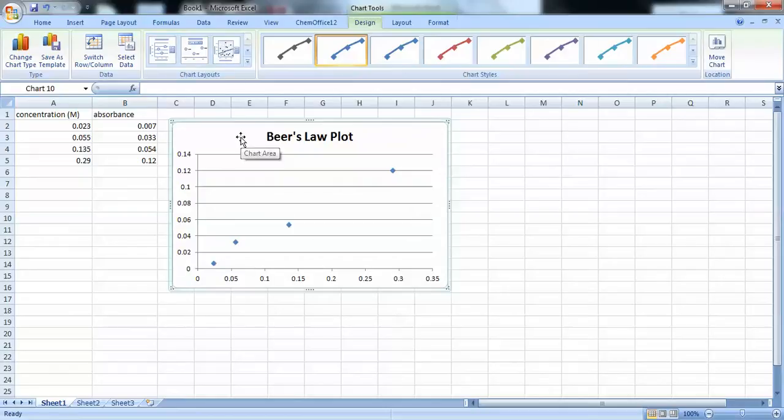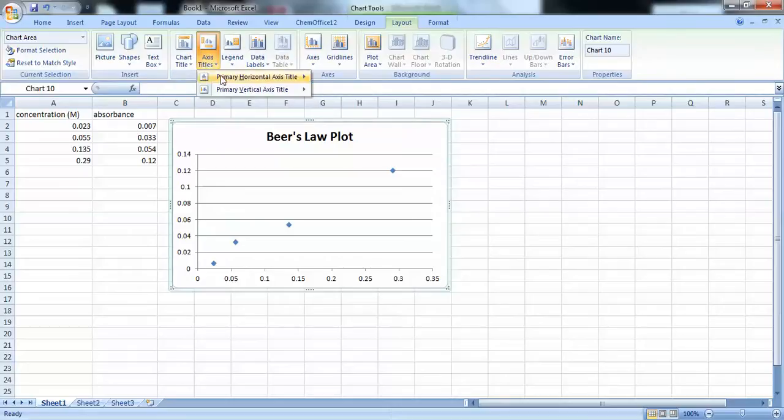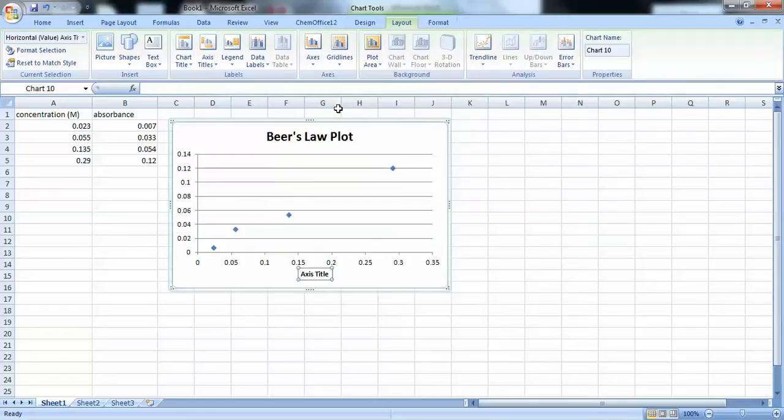So, to do that, click on the chart, go up to Layout, and go to Axis Titles. And select Primary Horizontal Axis Title and Title Below Axis. So, this is going to be your horizontal or your x-axis, which is concentration.